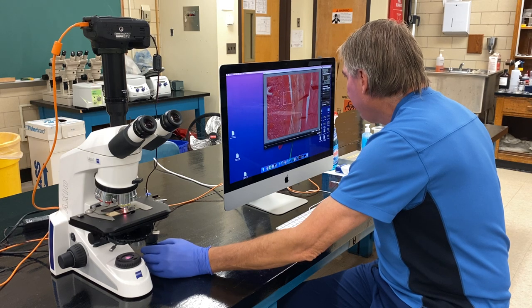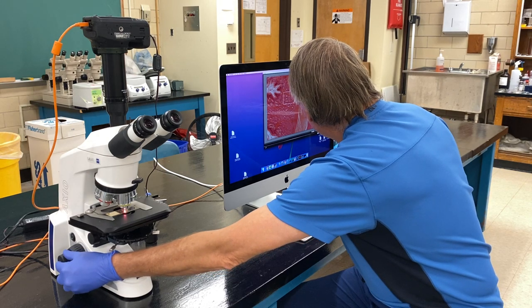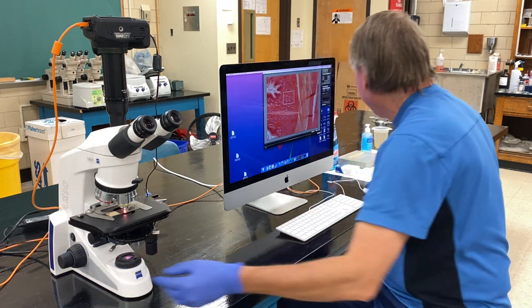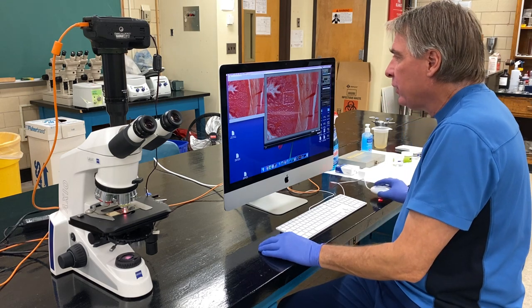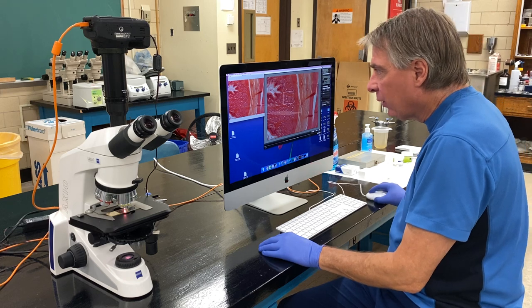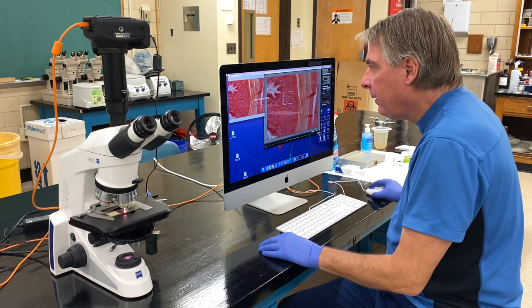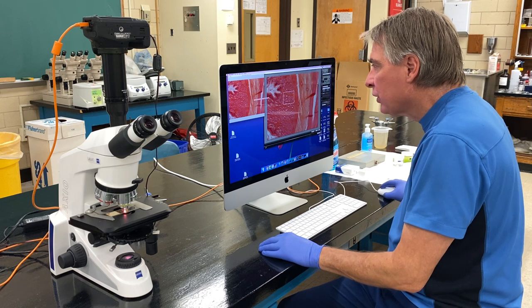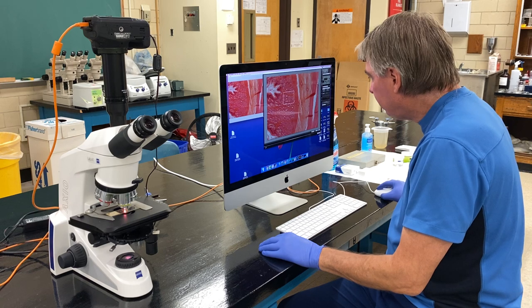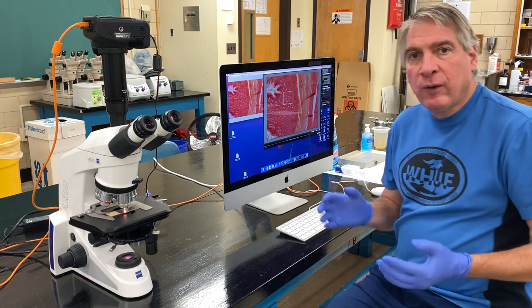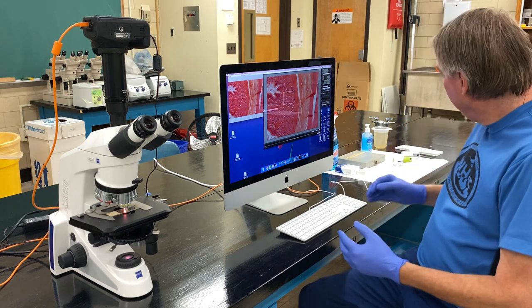Turn off the eyedropper and close the window. Move the sample back in place, refocus, then try a shot by pressing the shutter. The image came out okay — the white balance looks good and the brightness/exposure looks pretty good. That's a decent image.